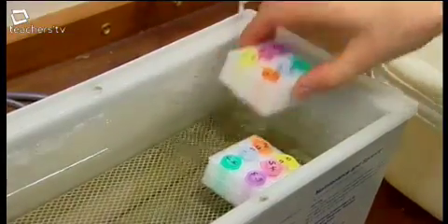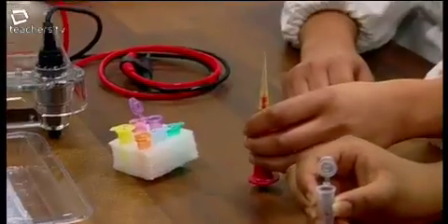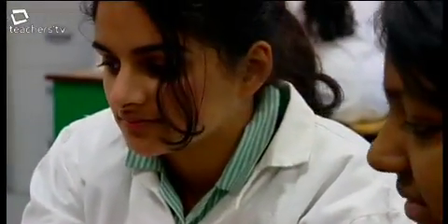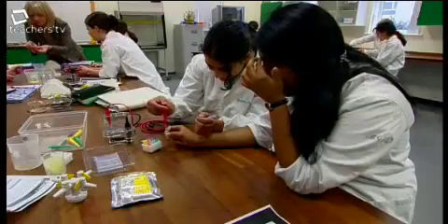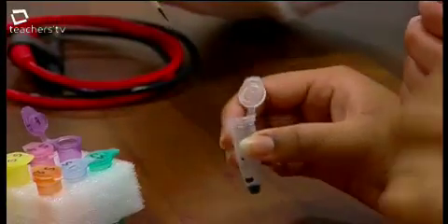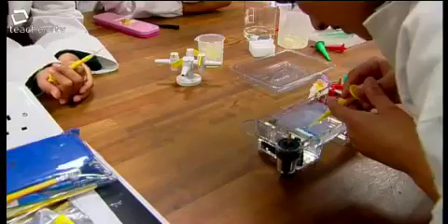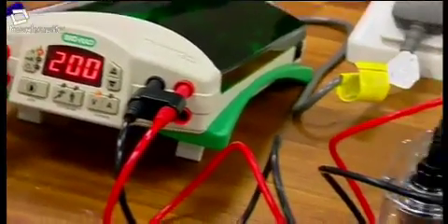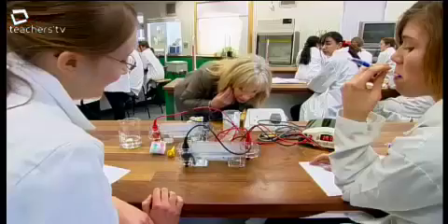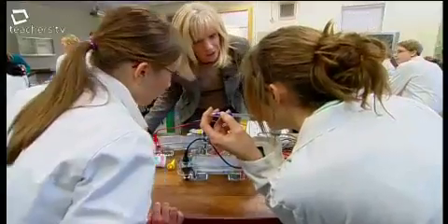Prior to the lesson, we had pre-digested DNA samples from a crime scene. Those samples were digested using enzymes known as restriction endonucleases, and they break up the DNA into small fragments. The girls were given those fragments, which they then mixed with dye. The dye plus the fragments were then placed into wells in the electrophoresis gel, and then an electrical current is passed from one side of the gel to the other, causing the fragments to separate. It's so hard to see, isn't it? But they have had 15 minutes.